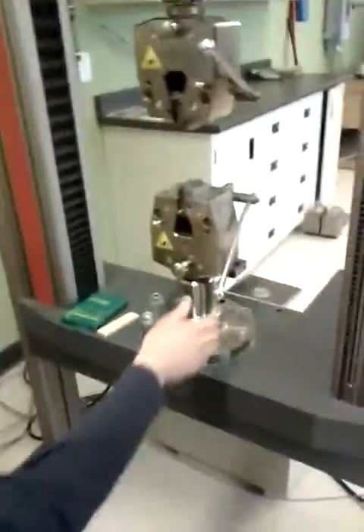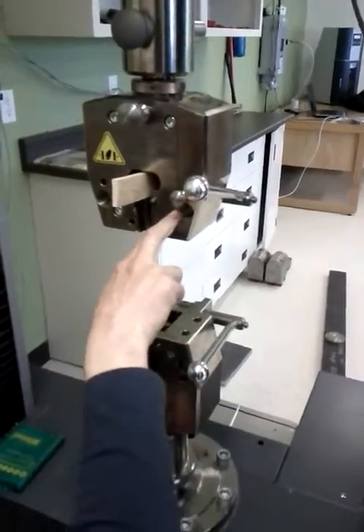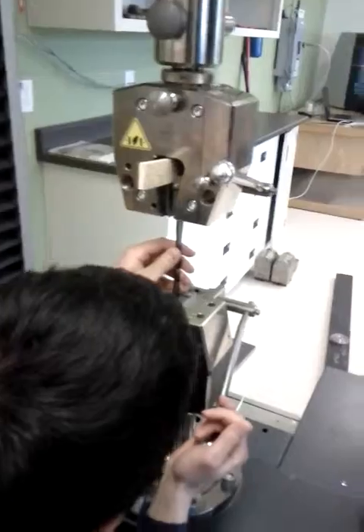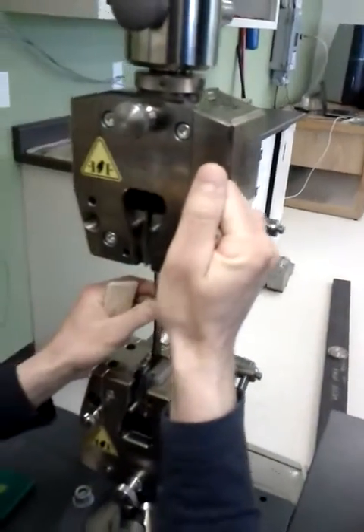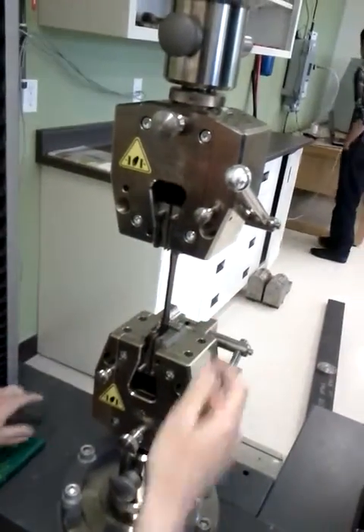Now I can put the sample inside of it. The grip at one is much better than this one. I put it on the center. It's about here. It's about at the center.